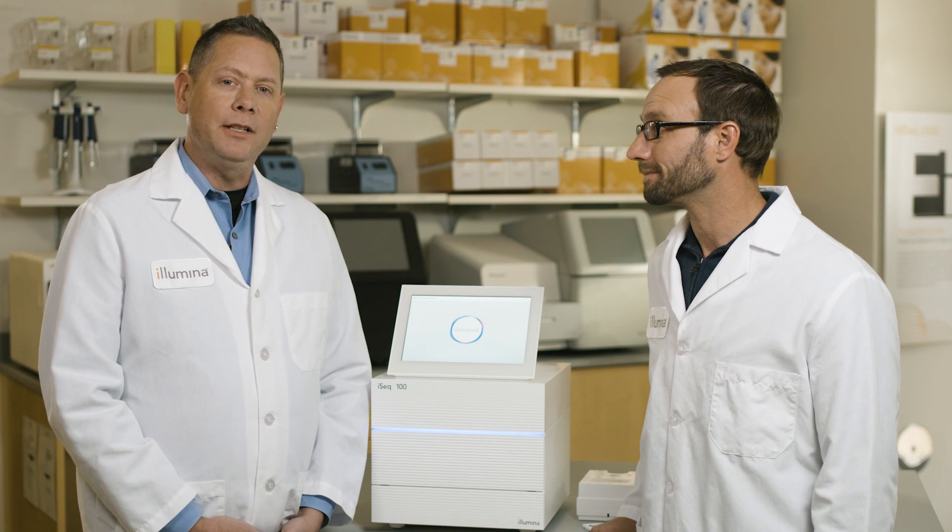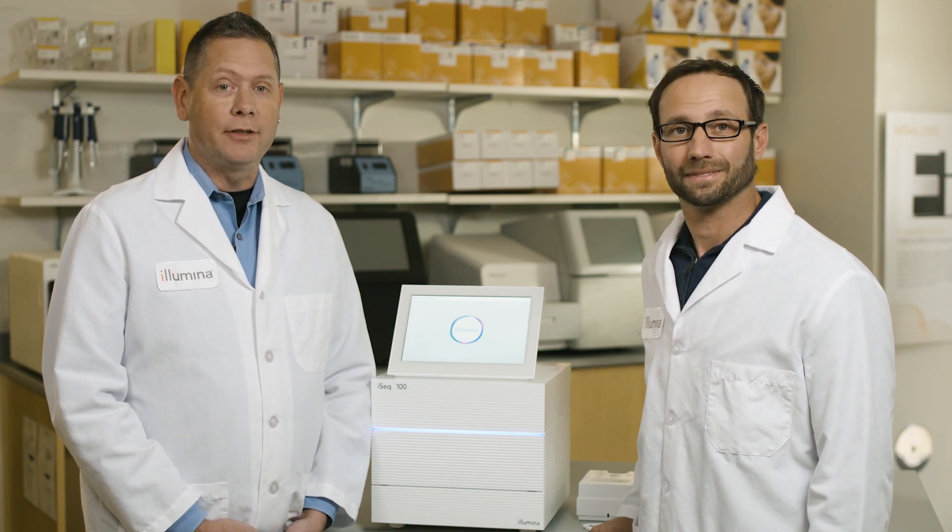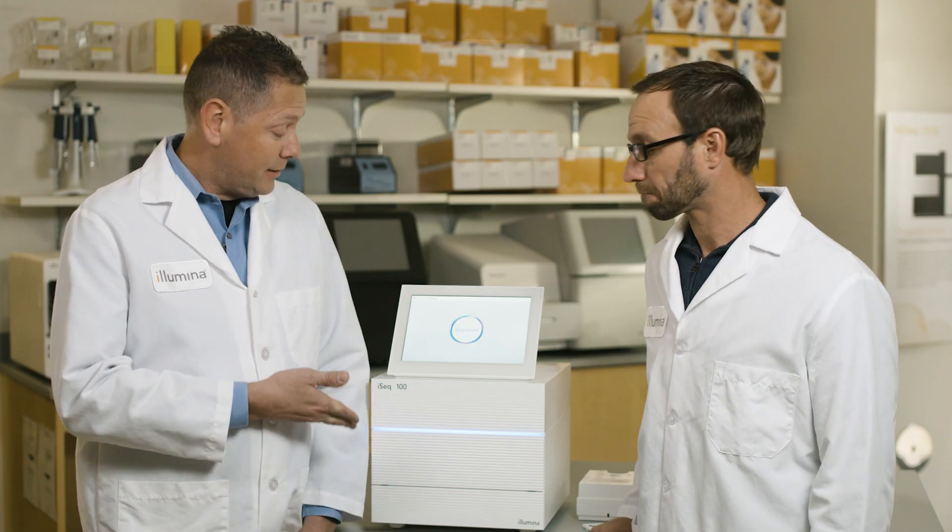Hi, I'm Brian. And I'm David. Welcome to the Illumina Solution Center. We're here to give you a behind-the-scenes introduction to the newest innovation in the world of next-generation sequencing from Illumina, the iSeq 100.